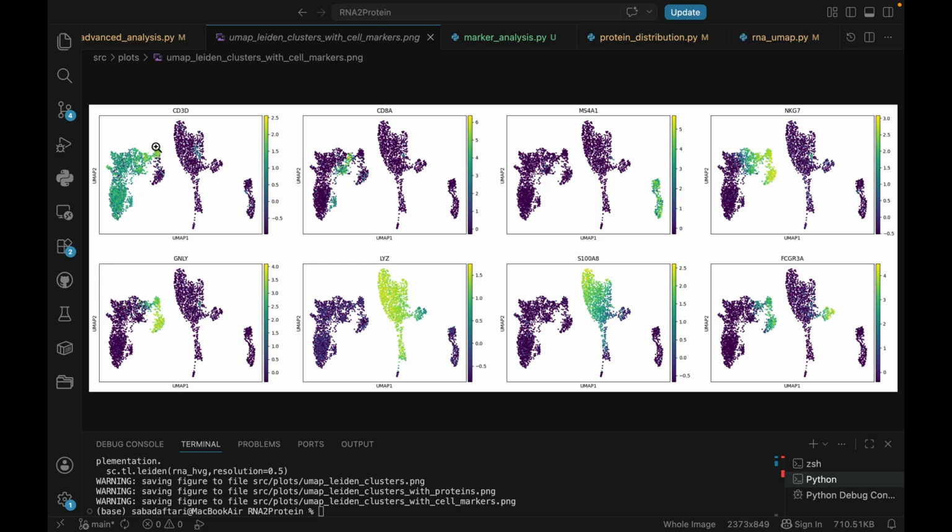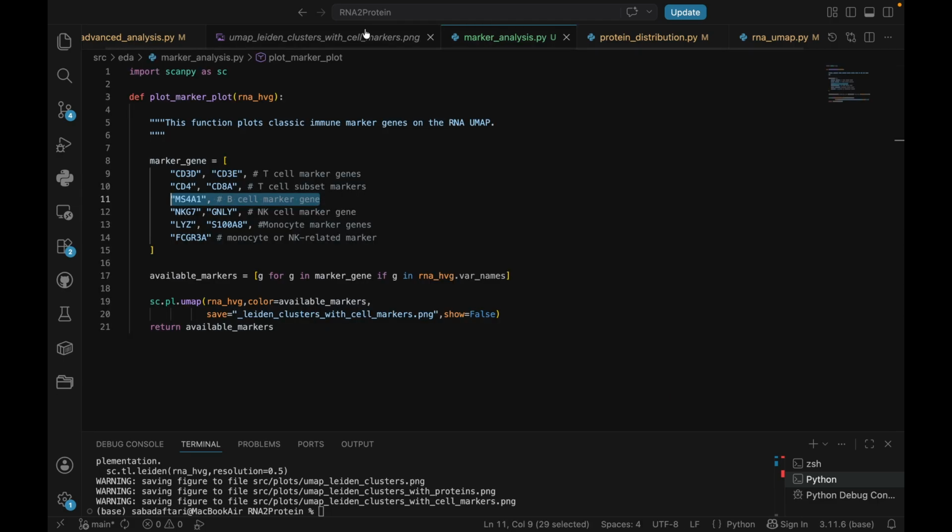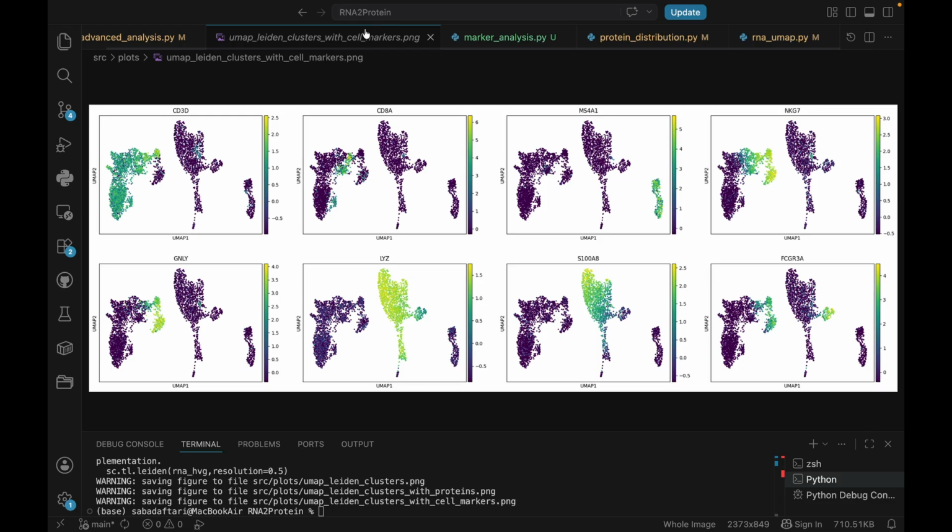This guy has the left blob very light, this has something in the middle, and this is like this cluster and this cluster. Yeah, so these could be separately indicating different markers as they are only by themselves.